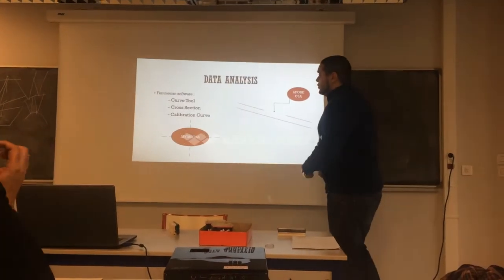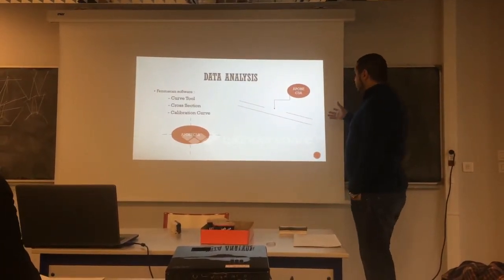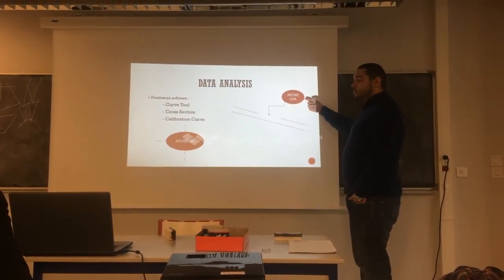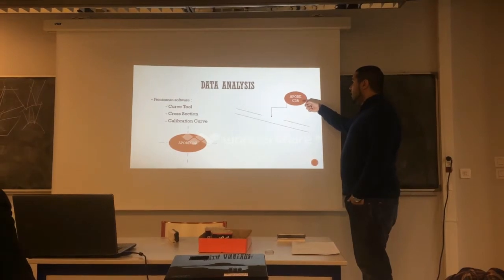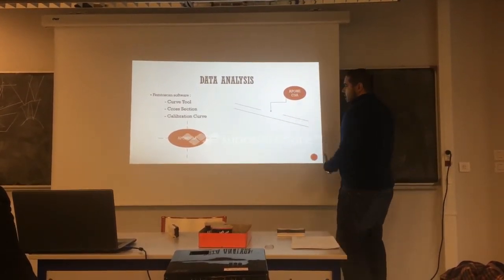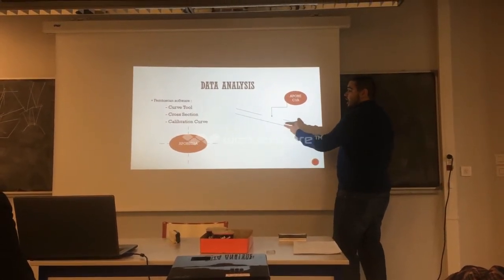So the data analysis was done by a software called FemtoScan. Now I'm going to talk about FemtoScan for the simple reason that it was used to verify the position of the bond between the A3A APOBEC protein and the DNA hybrid. The reason is that FemtoScan has the ability to calculate the length of the DNA hybrid used.